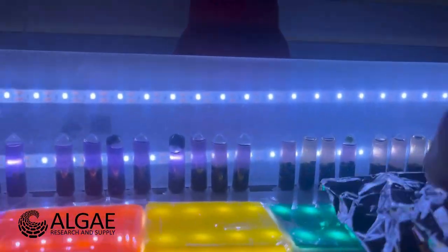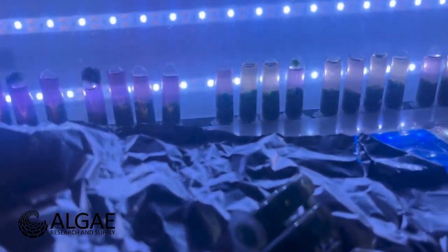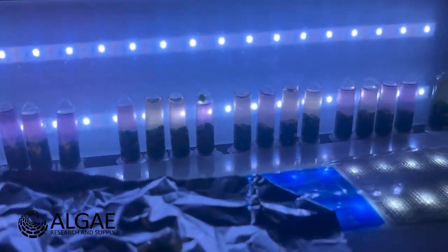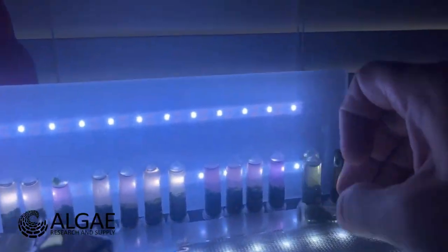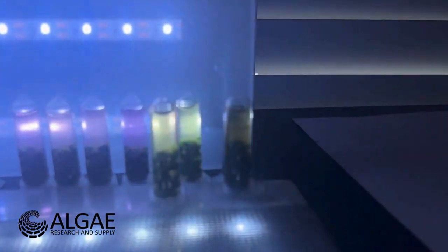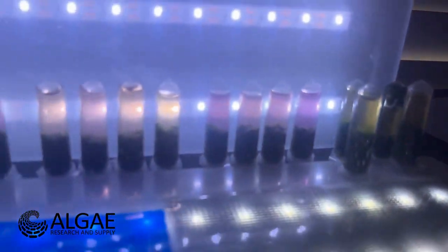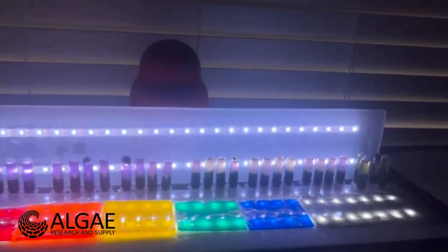But then finally we have all of our controls that were wrapped up in the aluminum, and I'll set those over here as well. And this is what everything started as, which is this fine shade of yellow there. So there's our dark controls. And again, we did see what we kind of expected here.